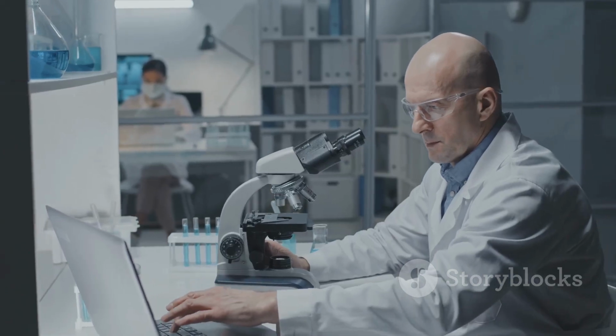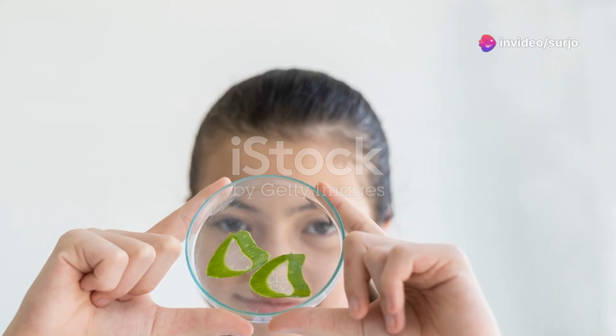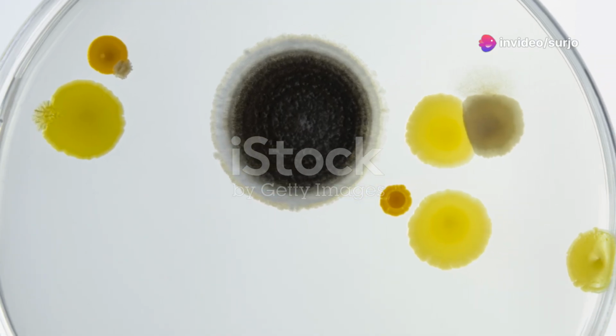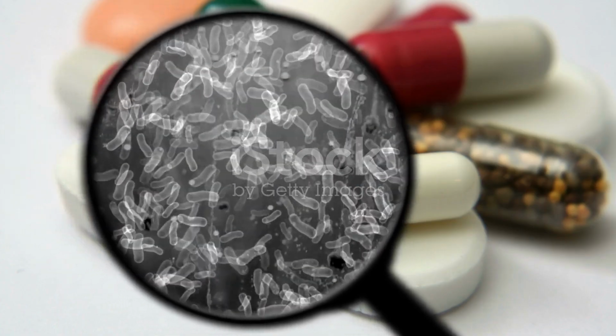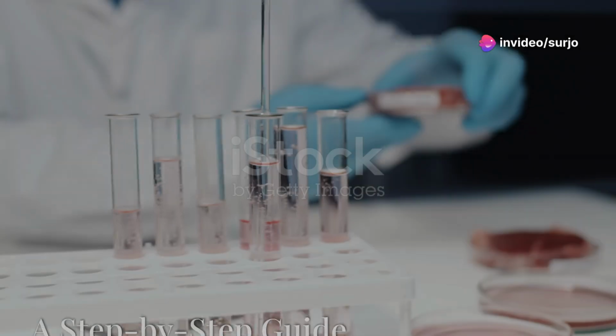Gram staining is a cornerstone of microbiological analysis, providing rapid and valuable information about bacterial identity. This simple yet powerful technique has revolutionized our understanding of bacterial diversity and continues to be an indispensable tool in clinical diagnostics, environmental monitoring, and basic research.